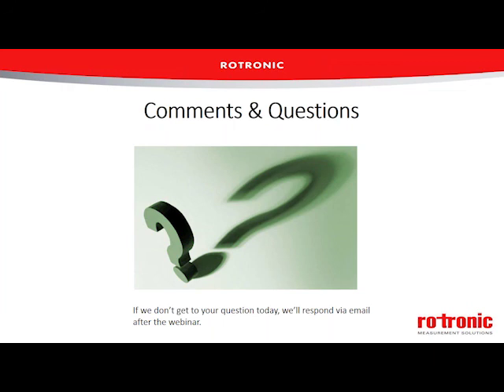Here's one from Nathaniel. Does the two-pressure generator have to be calibrated or traceable? And then is a QA/QC for it. I'm not sure what he means by that. But absolutely, any instrument like that does need to be calibrated and traceable. A two-pressure generator, though, gets its traceability not through relative humidity. Typically, there won't be any direct relative humidity measurement inside the chamber. It gets it through the temperature sensors and the pressure sensors inside the chamber. So all those sensors get calibrated and are traceable, and that gives you the traceable relative humidity readings.